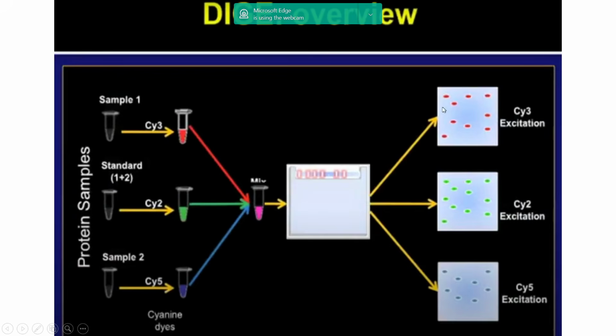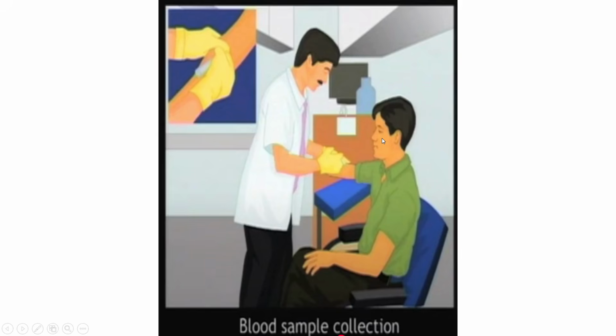If you visualize this, you will see all of the proteins, whereas some proteins might be missing in sample one and some might be missing in sample two. Then accordingly you can do an analysis. For example, this specific protein was getting overexpressed or expressed only in sample one but not in sample two, because that was the treated sample, and this was the control sample or might be the disease sample. Depending upon your experiment, you will do such analysis and check which proteins got upregulated or downregulated, etc.